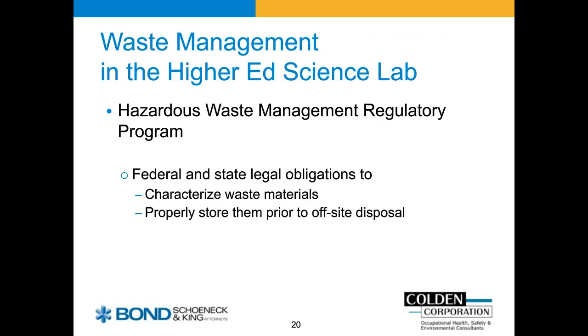Thank you. My focus here is on waste management in the higher ed science lab, and for that we look at the hazardous waste management regulatory program. There are federal and state legal obligations to characterize waste materials and then properly store them prior to off-site disposal. And for that, we're looking at the federal law known as the Resource Conservation and Recovery Act, or RCRA.